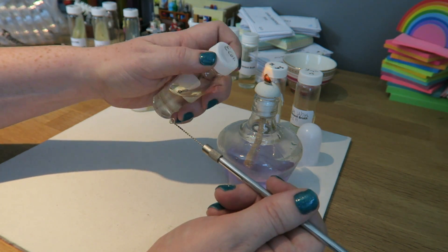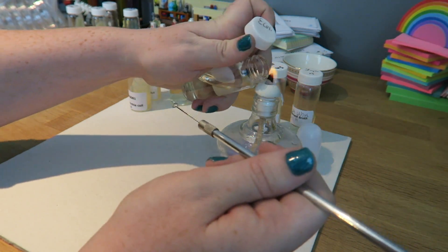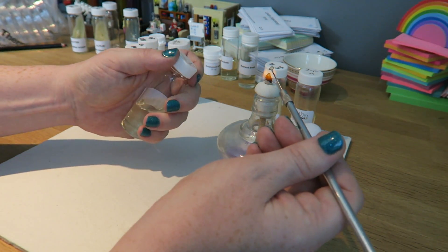My nutrient broth — open it up, flame it, inoculate it, flame it, close the lid, then heat the loop.